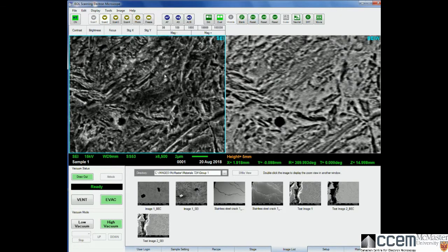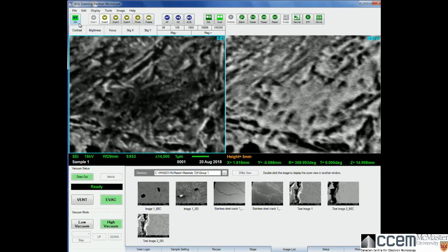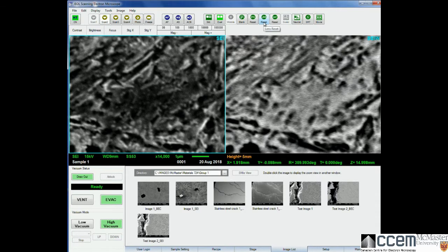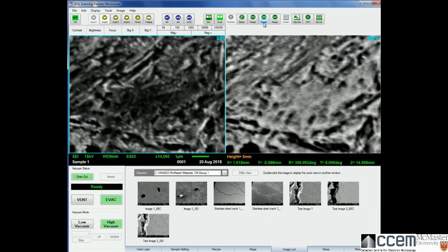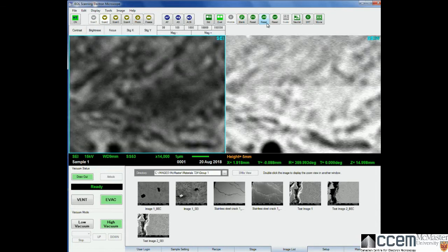If you have an image that's charging, you will get more stigmation. One of the things you should do at the beginning of your session is a lens reset. Because we have magnetic lenses, over time they will build up a charge, and we need to get rid of this charge by turning the lenses off and back on again. That's what lens reset does.